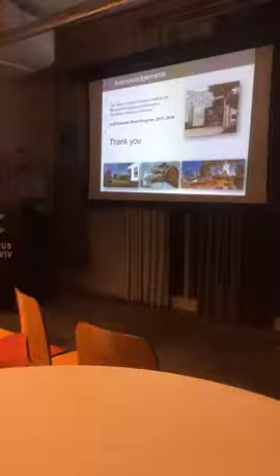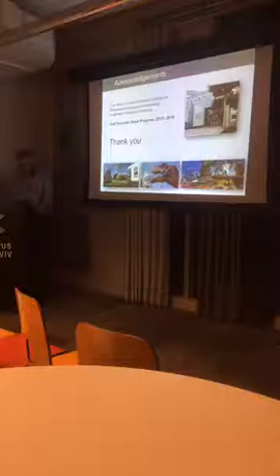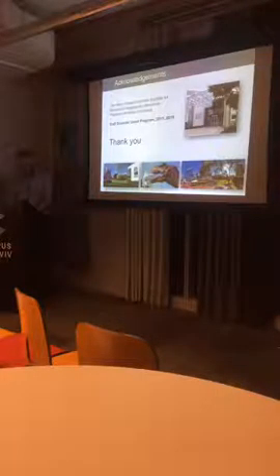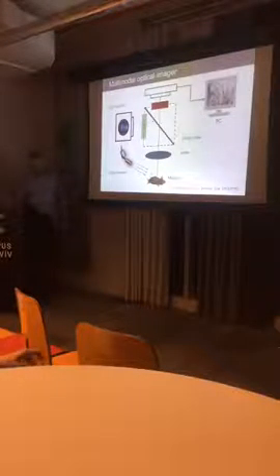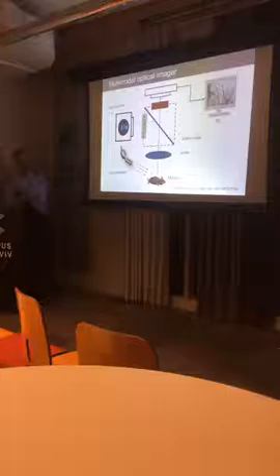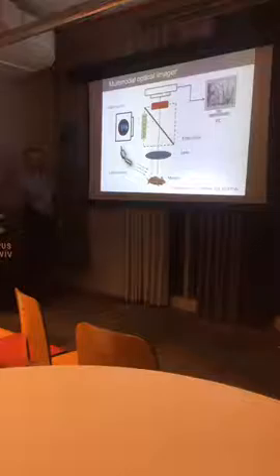If you go back to one of the first slides where you showed the two light sources, the beam splitter and both filters, in most of this talk you've only mentioned laser and camera. Is the extra LED and extra filter specifically for the fluorescence? Yes. This is both. It's just a schematic. I can use not only an LED, I also use the standard UV lamp, but LEDs work perfectly.